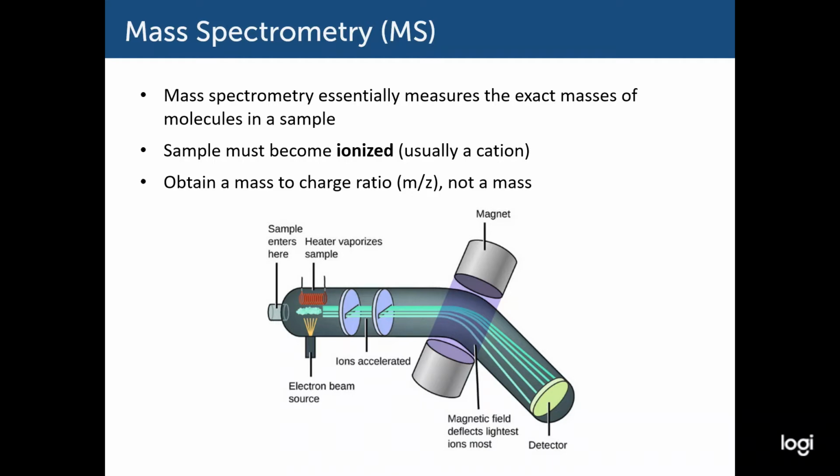They're not as heavily impacted by the magnet, and they actually end up at what we would think of as the top of the detector in the way that this image is configured. Lighter particles will actually get their trajectories bent more, and so they'll collide with what we would think of as the bottom of the detector in this image.